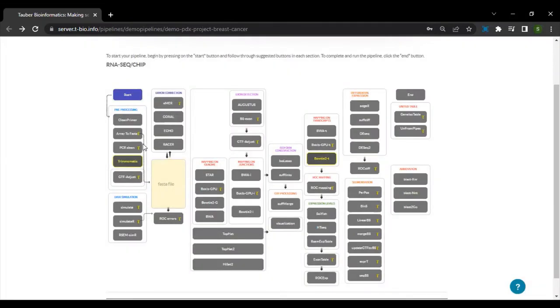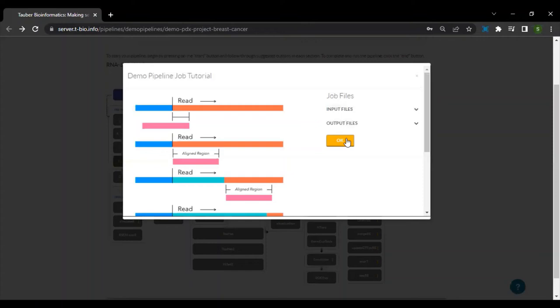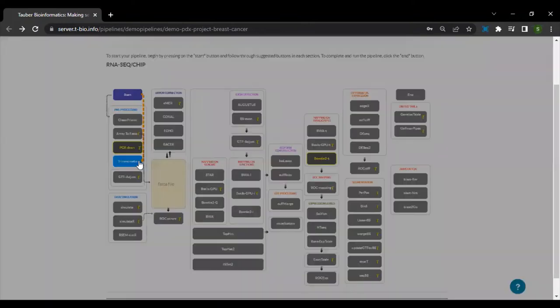Recall that RNA-seq analysis consists of three major steps. First, we have the pre-processing steps that make use of Trimomatic and PCR clean.